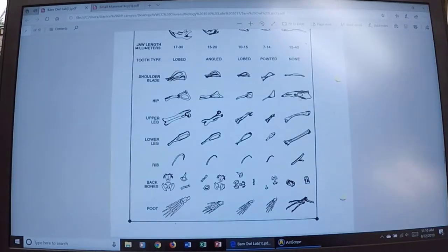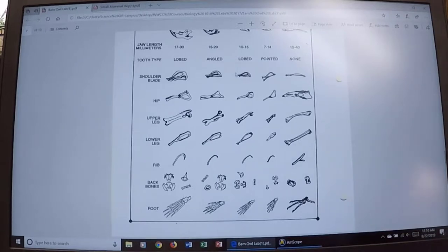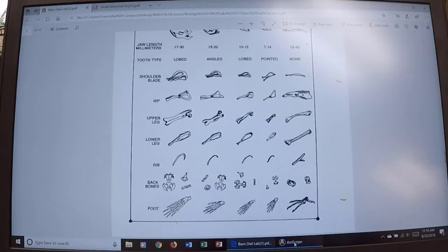Then I'll identify some skulls and show you features that are very important for skull identification. The first bone I'd like you to know is the shoulder blade or scapula. I'm going to put it under the microscope. Most of you are already fairly familiar with a scapula. You can see the features of it — where it connects to the upper arm bone, and the ridge that runs the length of the scapula.